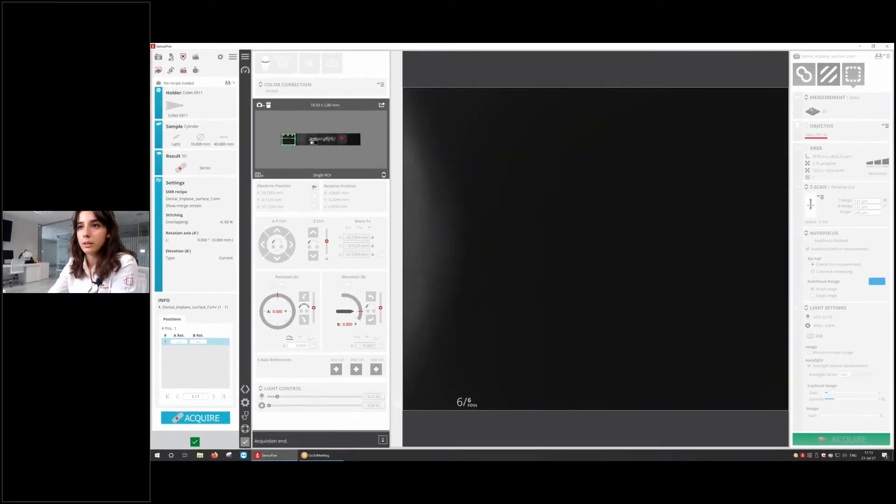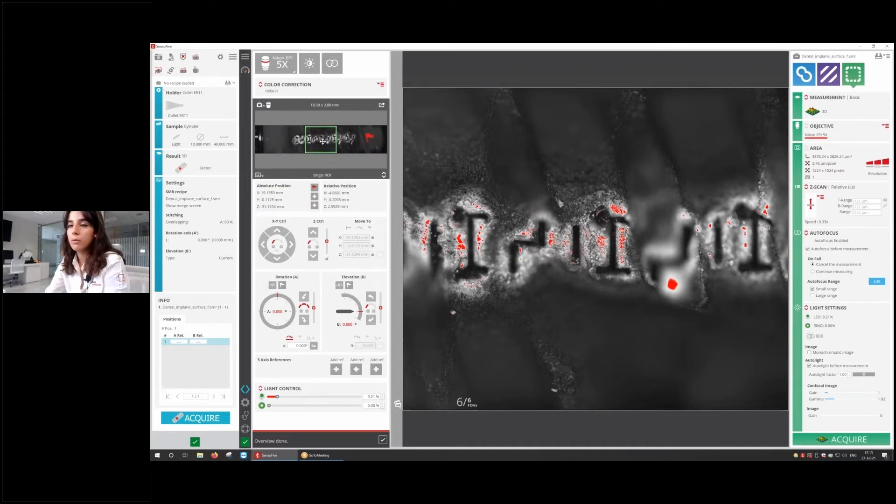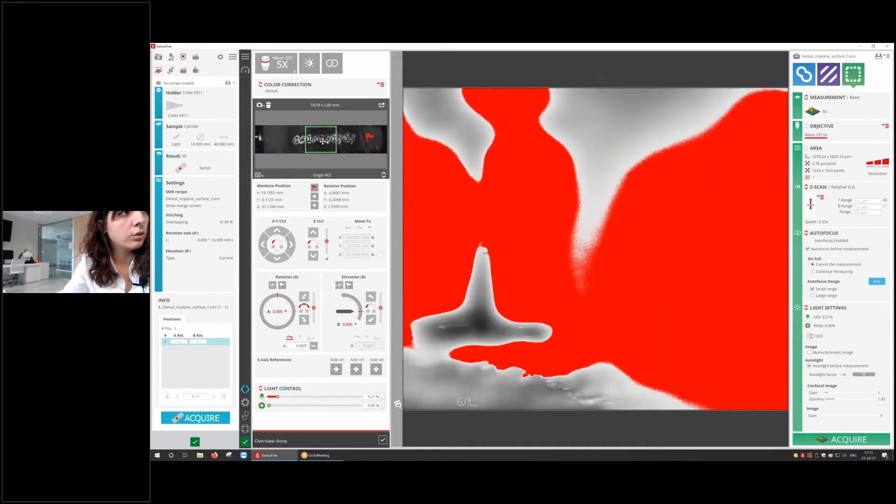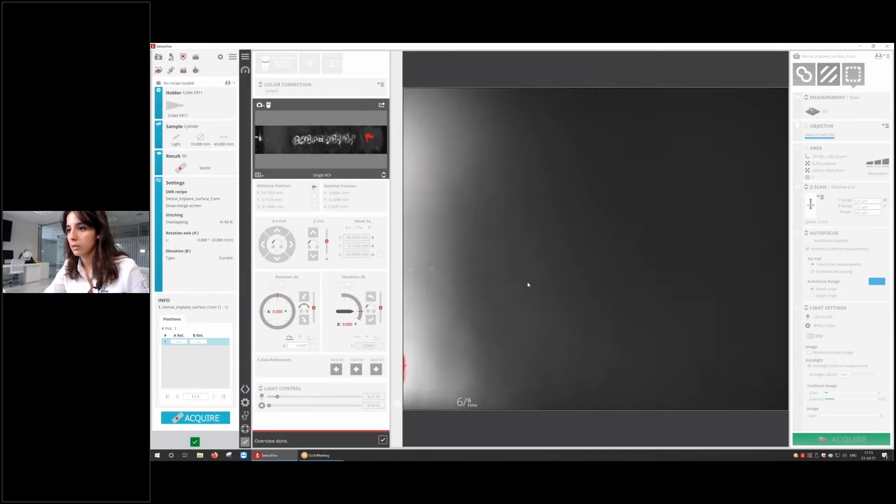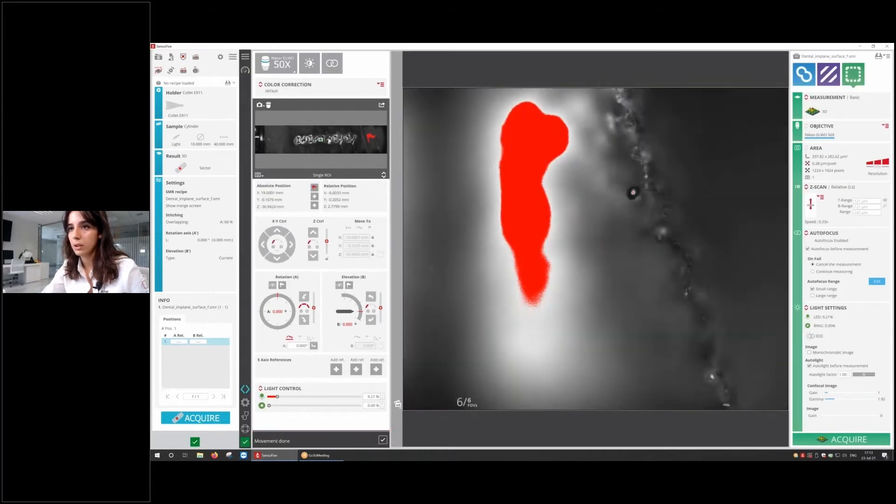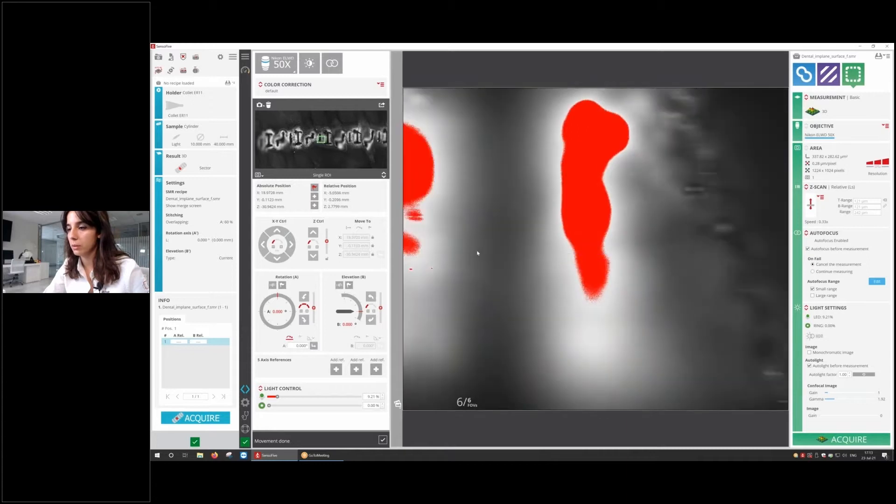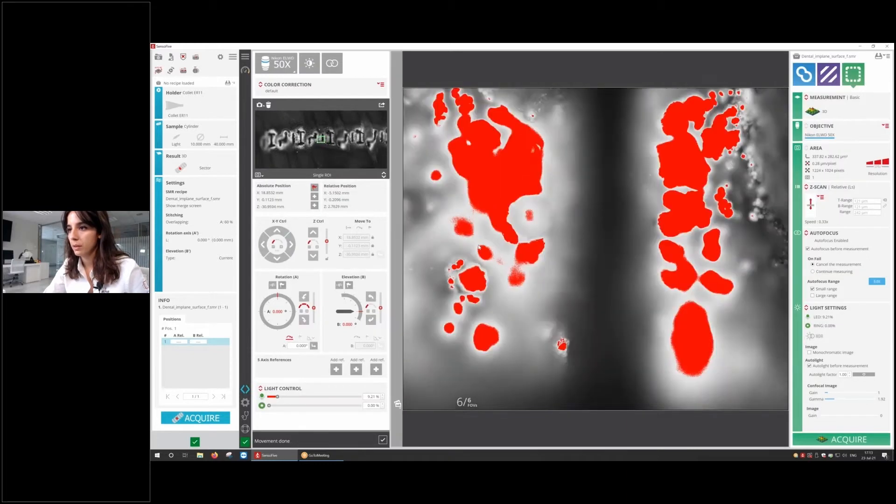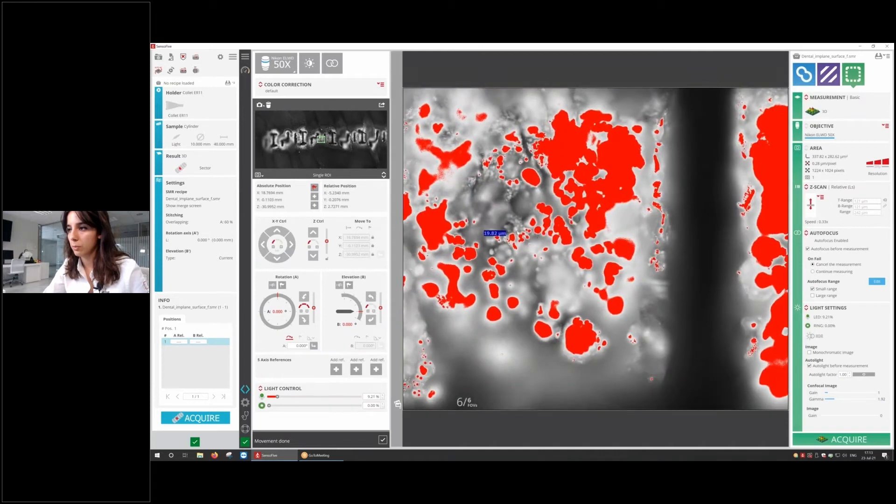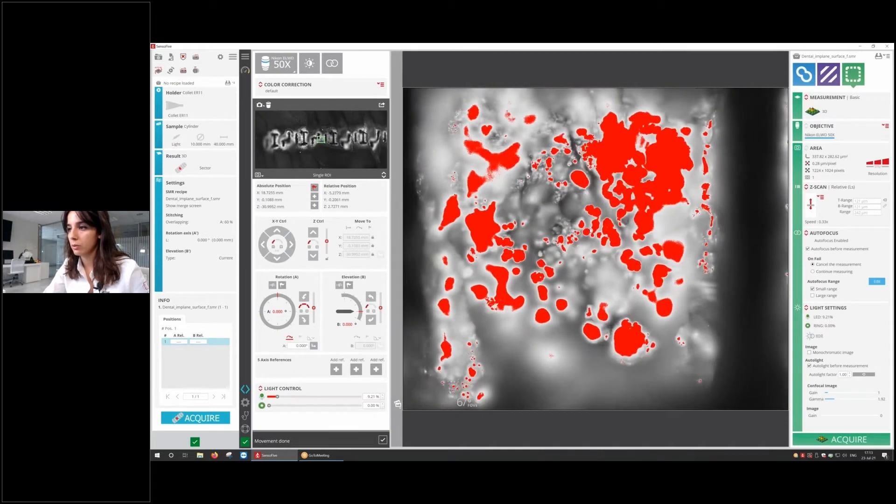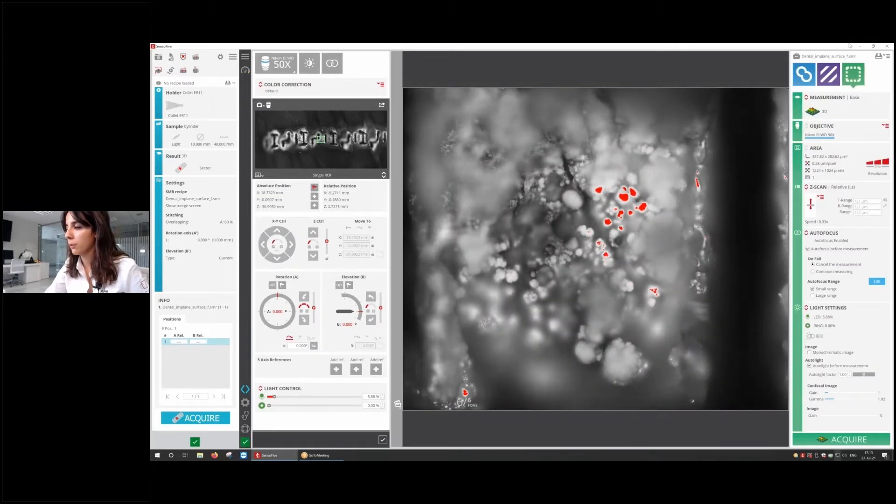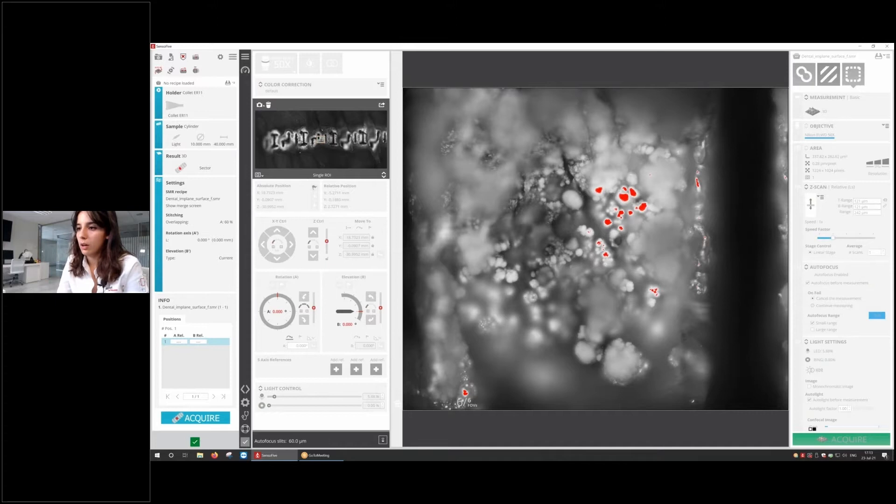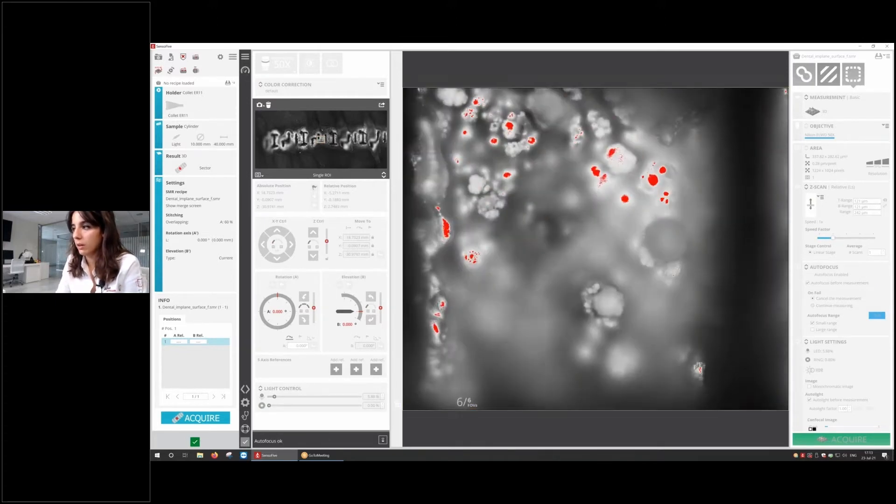To understand the sample, we're going to do an overview. This is how it looks like. Now for measuring the surface finish, we're going to change to a 50x extra long working distance, and I'm going to find the focus. This is going to help us understand where we are. In the middle of these two markings, we're going to measure. To do so, I loaded a recipe. It's going to do first an autofocus, then an autolight, and finally, it's going to perform the measure.